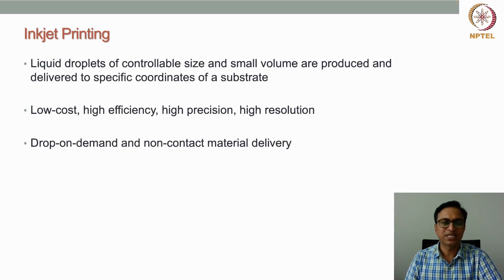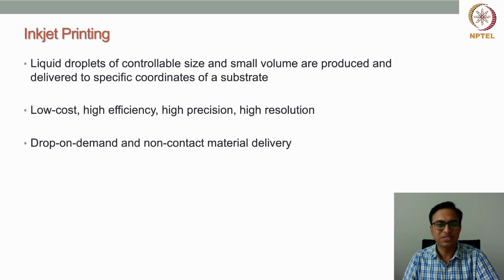That's why this printing technology is highly popular, because of all these advantages or characteristics: it is low cost, high efficiency, high precision, and high resolution.